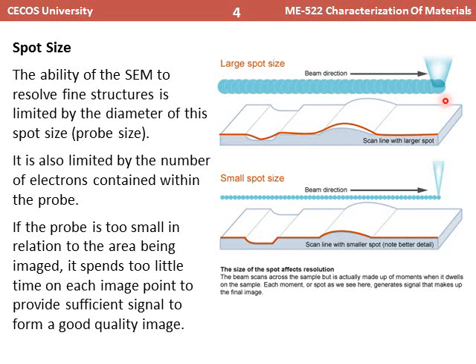But if you want to analyze the surface in more detail, then it's usually preferred to use a small spot size. By this means more time is spent over the surface, and the sharp curvatures or the very complex surface morphology can be scanned in detail.